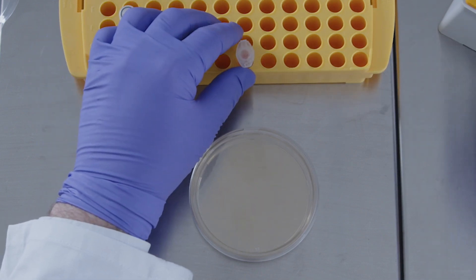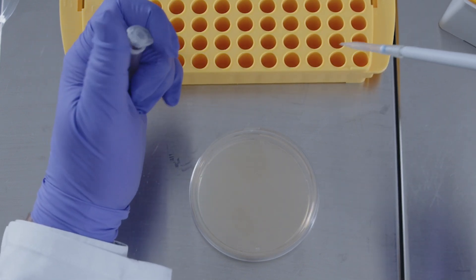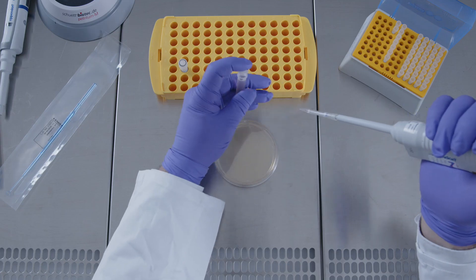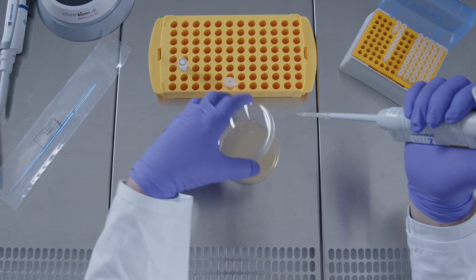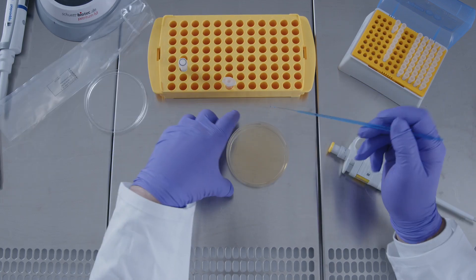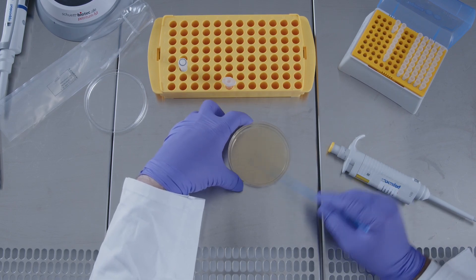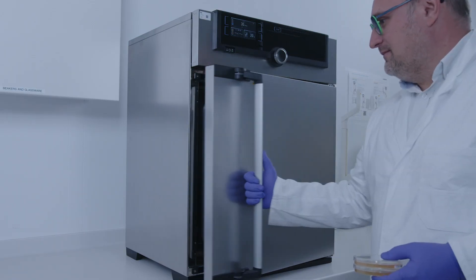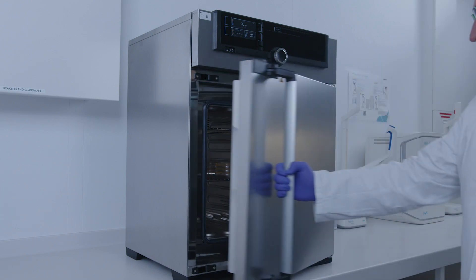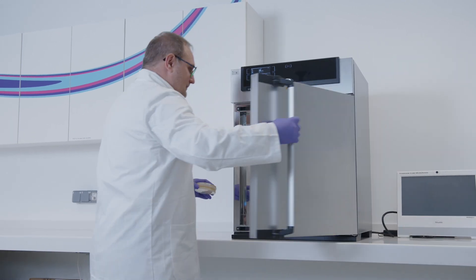Leave the inoculated liquid at room temperature for 10 to 15 minutes. Apply the right amount of inoculum onto an agar plate for the desired CFU. Spread the liquid over the entire plate. Incubate the plate according to the guideline. Take the plate out of the incubator and count the colonies.